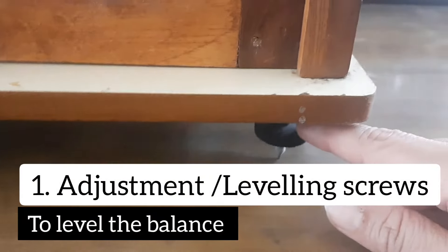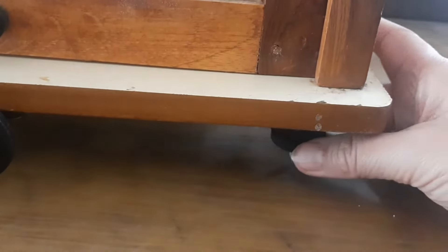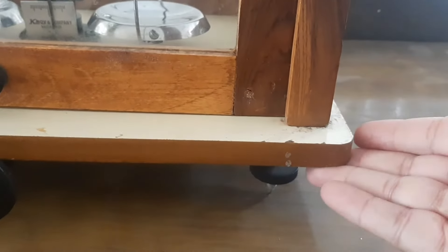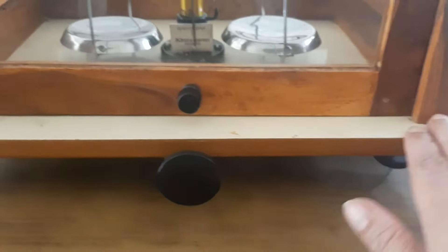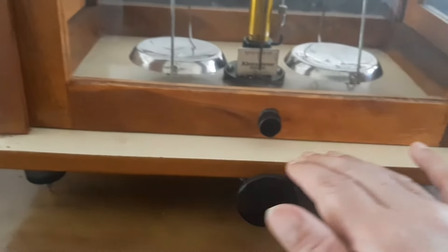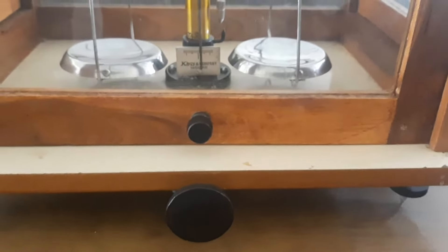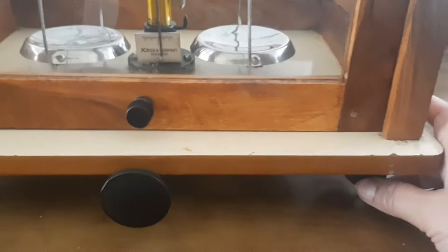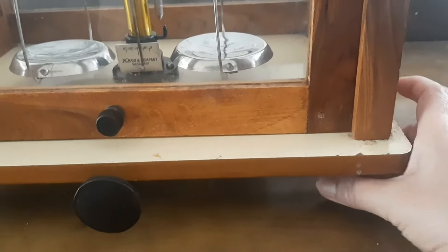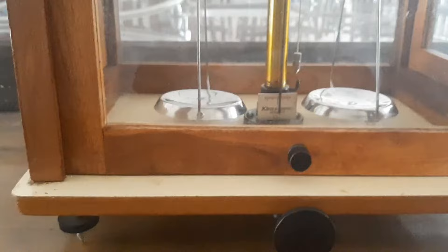At the bottom we have adjustment screws. If I move these screws either clockwise or anti-clockwise, the level is going to either move up or down. The purpose of these screws is to make the balance properly horizontal on the surface where we are making measurements, since every surface might not be absolutely flat.